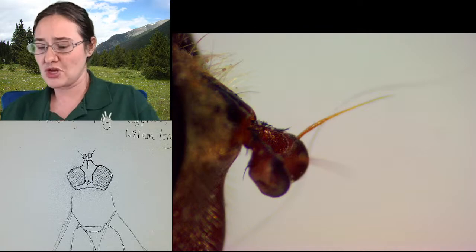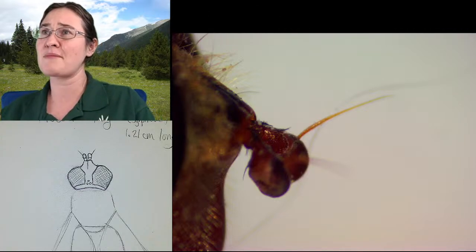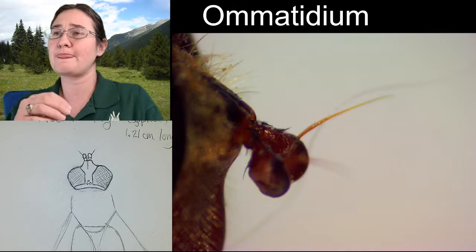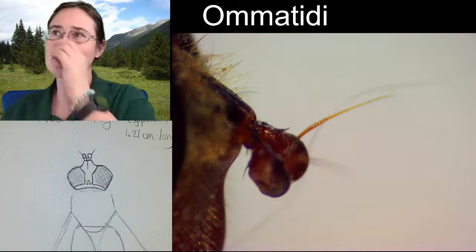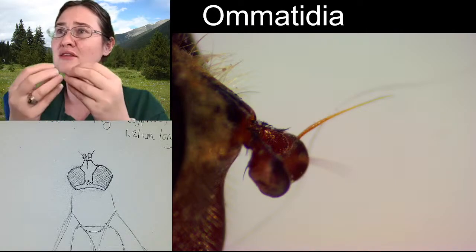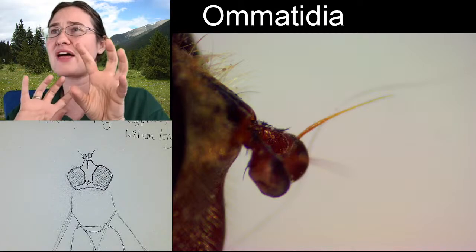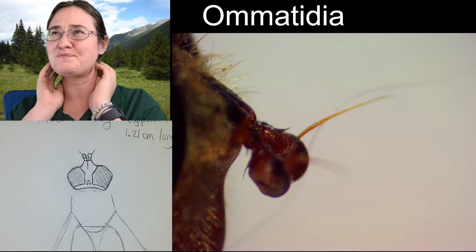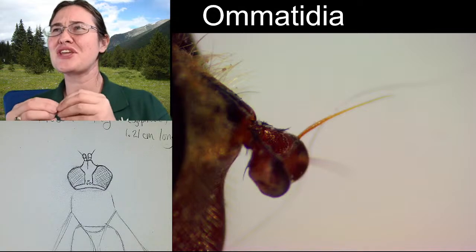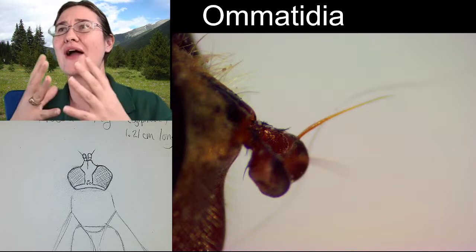So, we're looking at what we call compound eyes, and inside of compound eyes, there are things called ommatidia, and singular, it is an ommatidium, all right? So, the ommatidia are all of the individual lenses within the compound eye, and each ommatidium can actually have slightly different characteristics. You're going almost a little past where my knowledge is, but I'll explain it to you how it was explained to me.